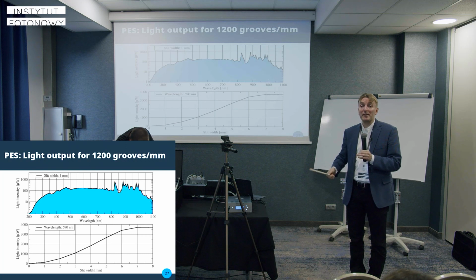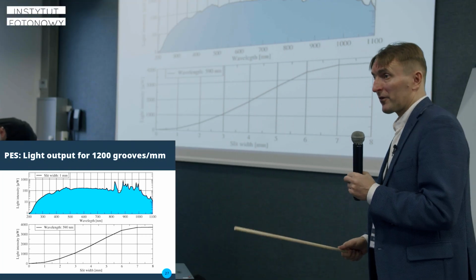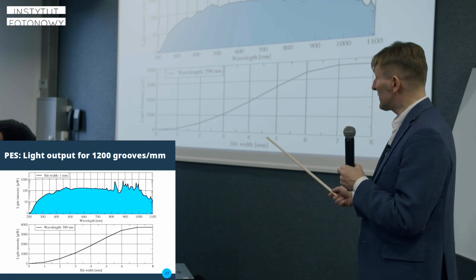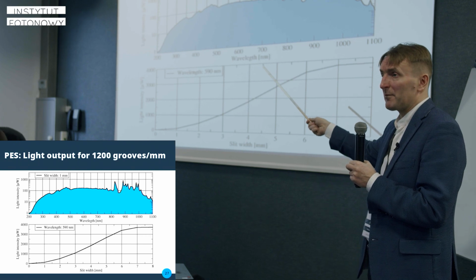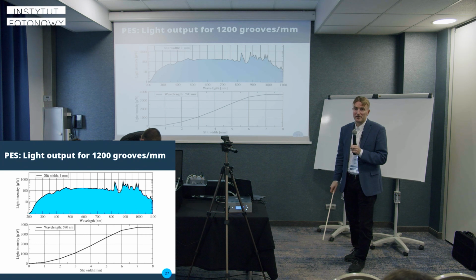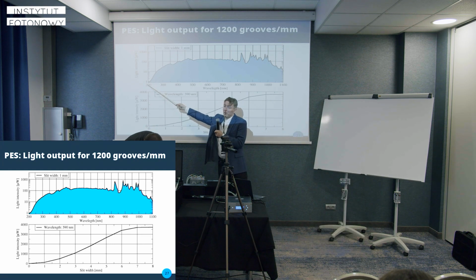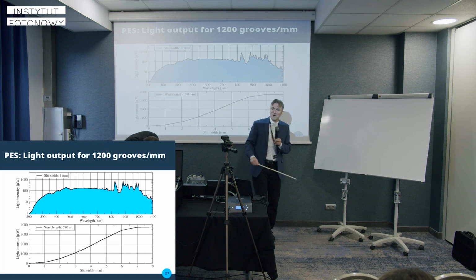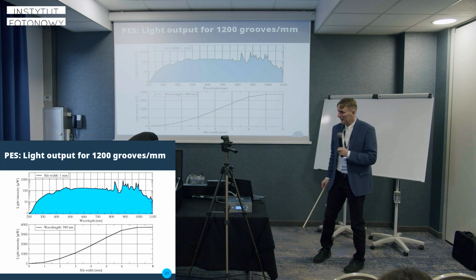It's not a direct characteristic of the xenon lamp. I mentioned the xenon lamp because I wanted to say that the range is basically determined by the xenon lamp and by the silicon detectors that we use. And if you cannot have light below that point from the xenon lamp, the monochromator will not produce it. All right.